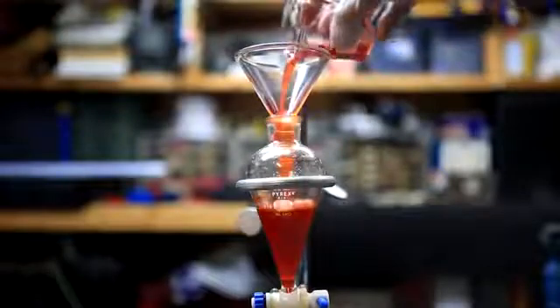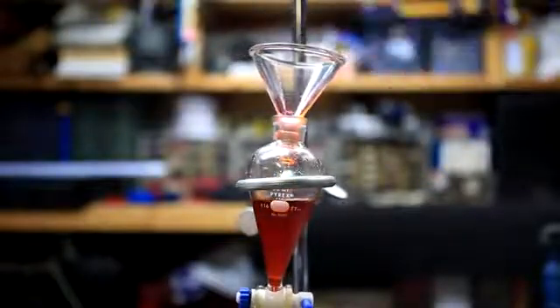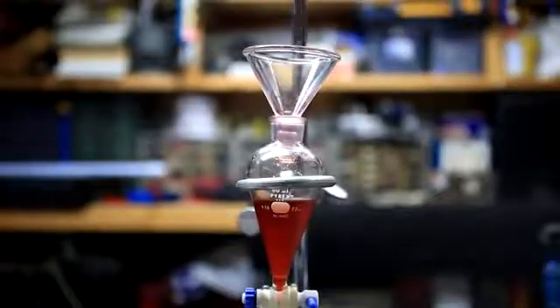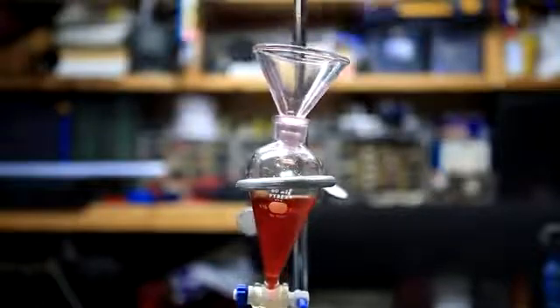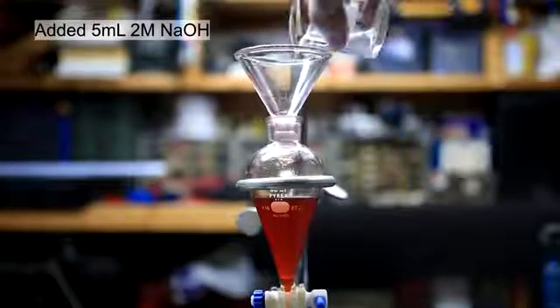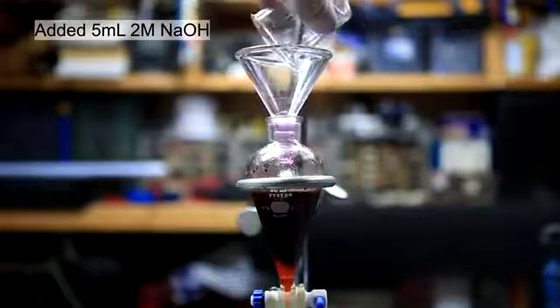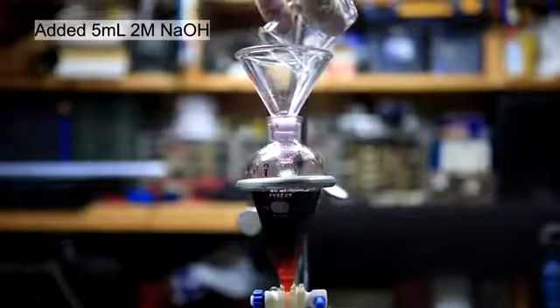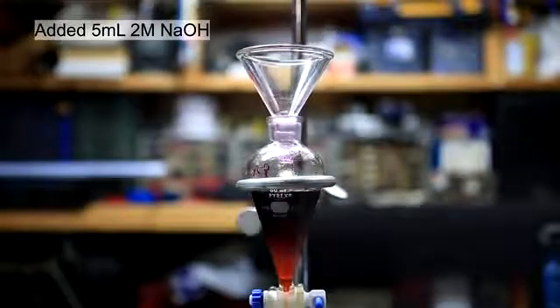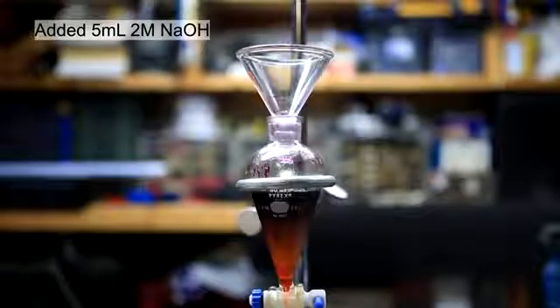The dichloromethane extract is poured back into the separatory funnel and the beaker is washed twice with a small amount of DCM. To this was added 5 milliliters of 2 molar sodium hydroxide. In this step, we're converting phenolphthalein into a water-soluble salt which has its characteristic purple color.